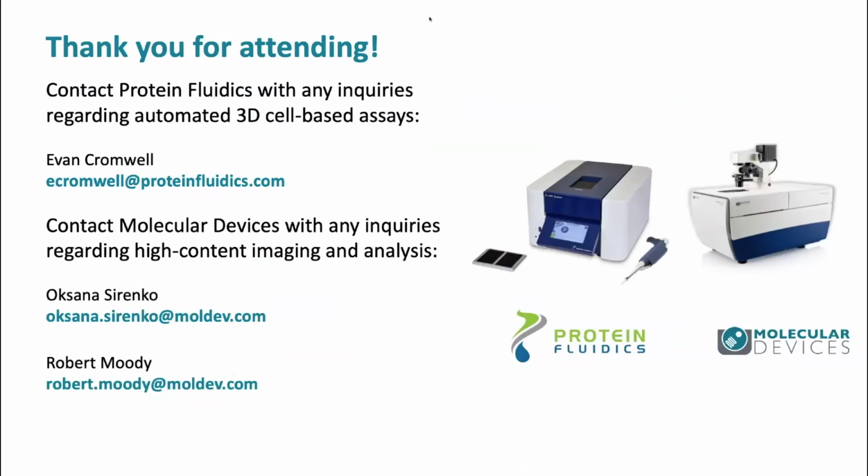Yes. So for this specific assay, we just diluted Matrigel slightly, let the organoids sediment, and then loaded them onto the chip and proceeded with treatment and staining. There's also a cell recovery solution that you can buy, which essentially dissolves the Matrigel off. I think that's commonly used if you want to passage your organoids. We've shown that if you use a cell recovery solution to dissolve the Matrigel, you can pipette the organoids out from your plate and transfer them into our Flowchips.